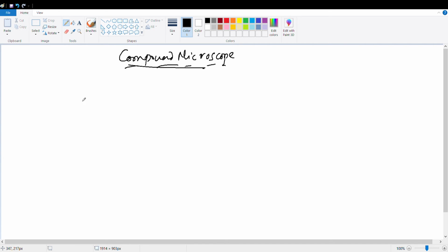ओके, तो आज हम लोग पढ़ेंगे कंपाउंड माइक्रोस्कोप। तो सिंपल माइक्रोस्कोप में हमने देखा, it is only a single biconvex lens. Simple microscope was not helpful because it could do only maybe 9x zoom, so it is not so useful. So that's why we are studying compound microscope. Compound microscope magnification is very large, maybe 1000x or more than that.